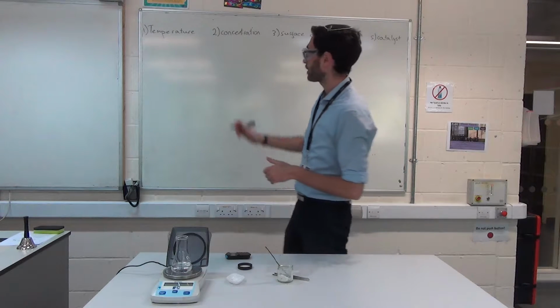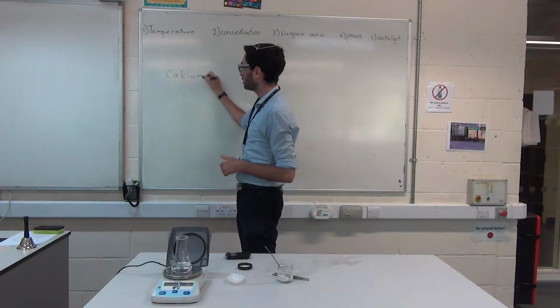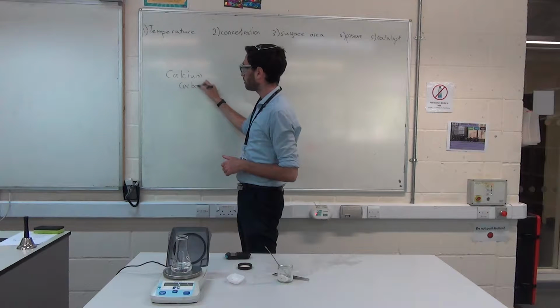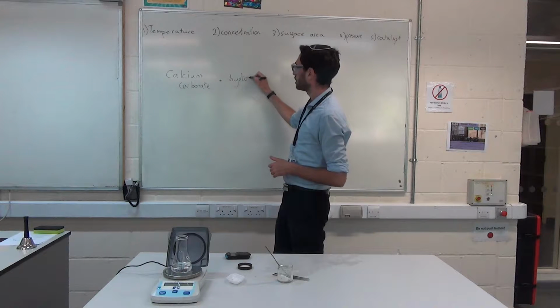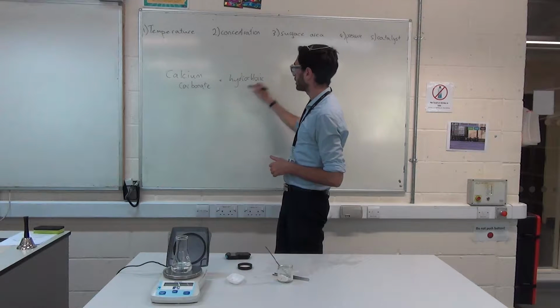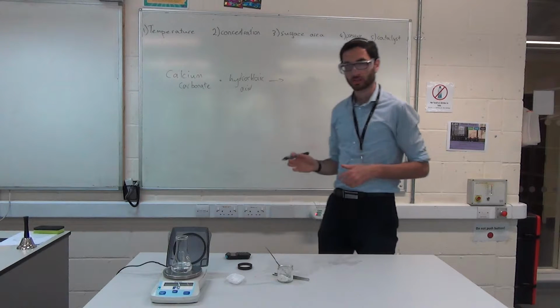The first reaction I'm going to do is I'm going to be adding calcium carbonate to hydrochloric acid. What are the products of this reaction?